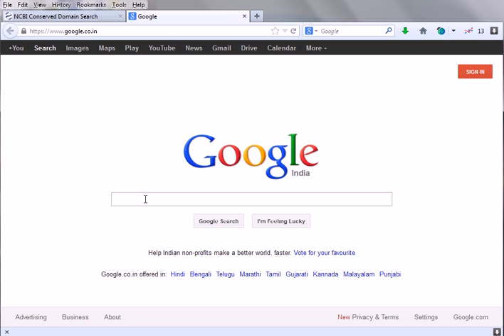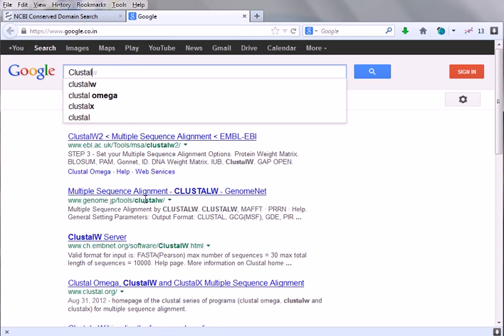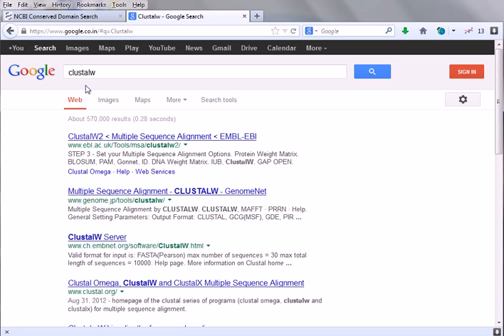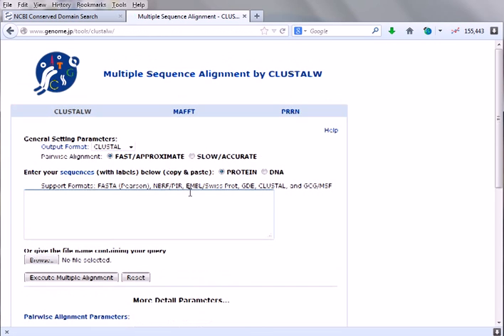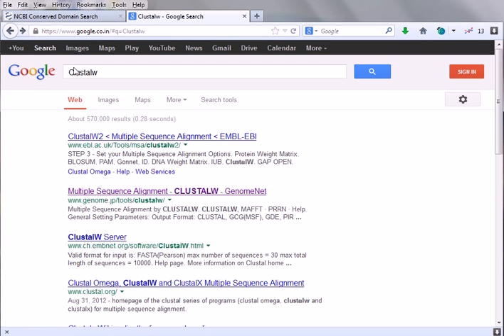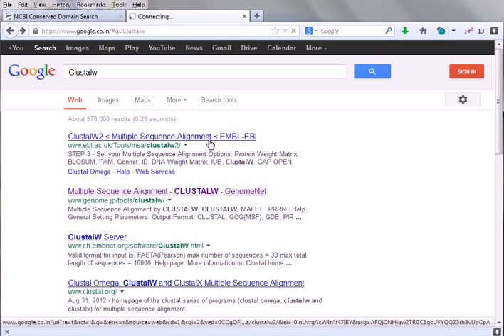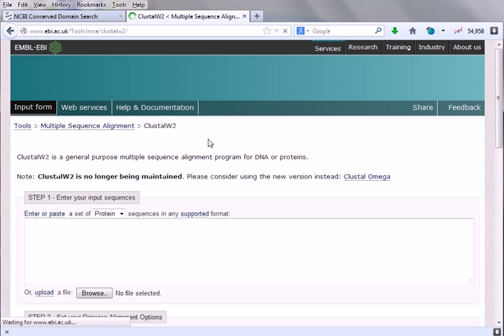We select this and here we can find the second link is Multiple Sequence Alignment ClustalW genome.net. Click on to this. It will take us to the site for multiple sequence alignment by ClustalW. Let us move here, just click on the first one so that it will take us to the actual page.